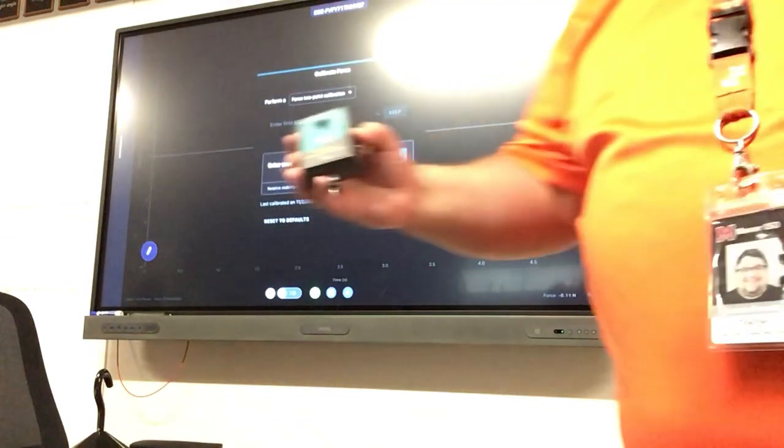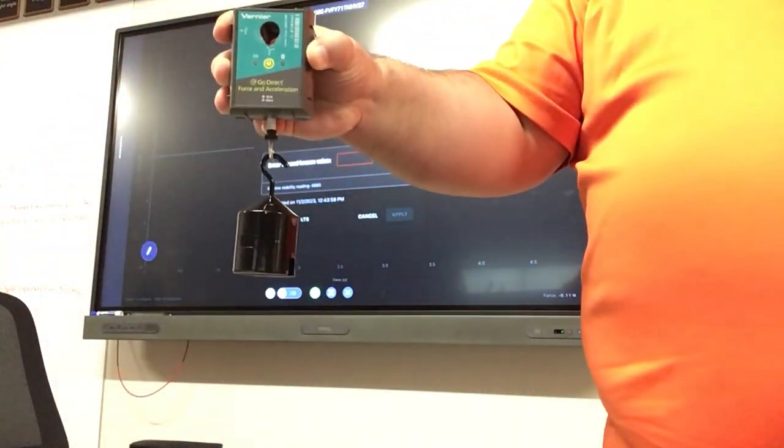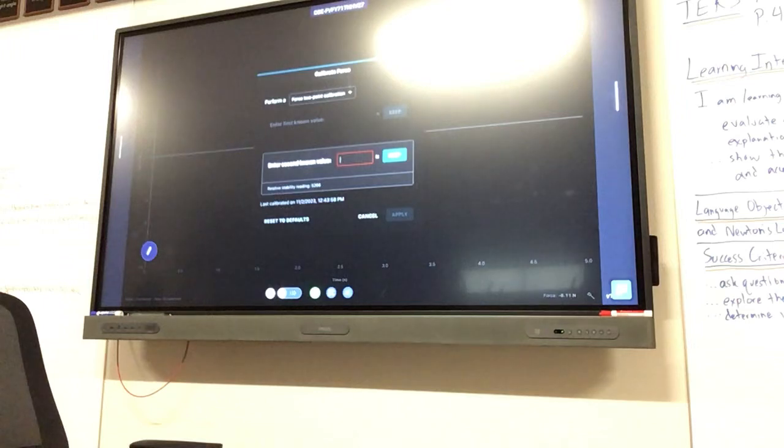Hit enter and then you're going to go and add the mass to it, just like that. And just let it hang there. Don't move it as much as you can. Try to keep it still. And you're just going to type in 4.9 for that one. Hit enter.